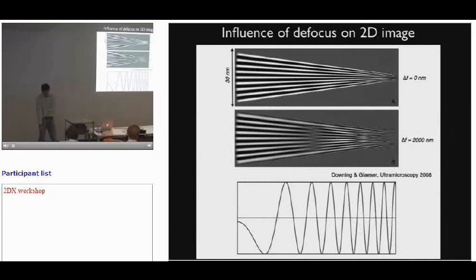One constructive way I thought of understanding this in more detail is if we look at a synthetic real space image, which is this kind of frequency ramp, where we have spatially distributed all the different frequencies, and that helps us to understand this. If we follow one of these ramps, so if we go for black, and we go all the way, it remains black. However, if we apply the contrast transfer function to it, we see that the black all of a sudden becomes white, becomes black again, becomes white, and this is pretty much what you see. So the moment you're moving into this frequency range, which would correspond to this area, then you have a reversal in contrast, again a reversal in contrast, and so forth. And also the image information is displaced. In order to recover that, you obviously shouldn't cut that off.